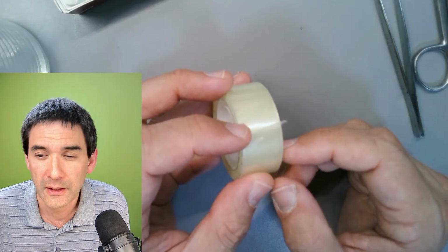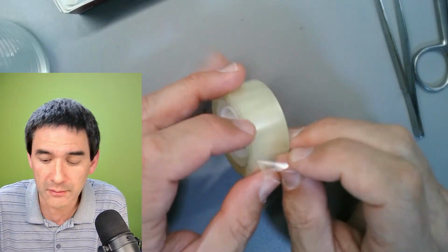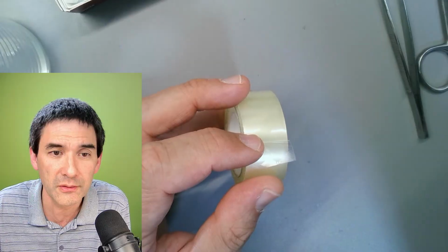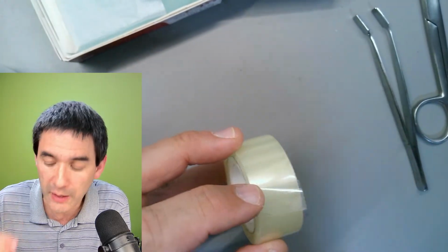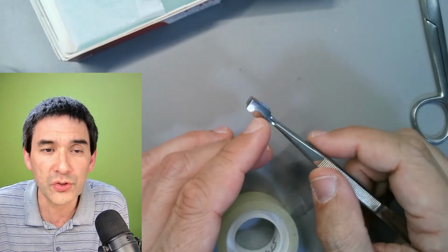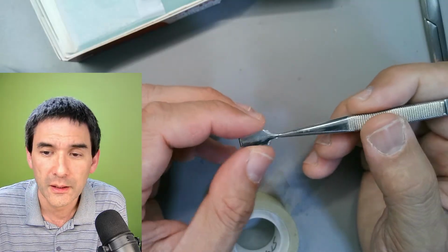So what I would like to show you is you need some sticky tape. Okay, let me focus this a little bit here. Okay, that's kind of clear. You need some sticky tape. I'm going to show you how you can extract them from your eyelashes. I like to use, you need those tweezers, and you see those tweezers here are pretty flat.